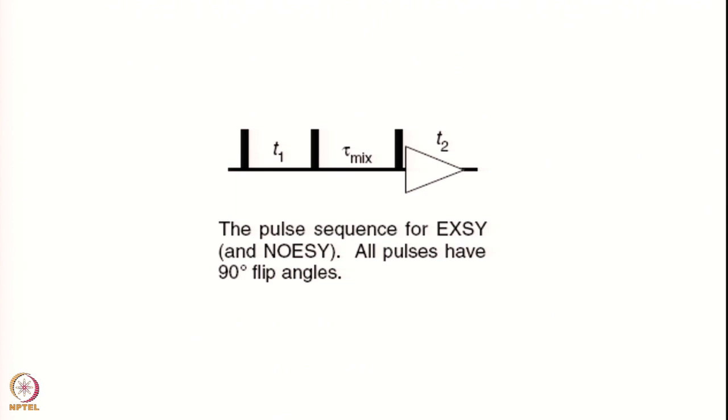Okay. Now, this brings us to another important experiment, and that is called the NOESY. So, we will only make a small introduction to this. We will take this up in greater detail in the next class. This is again an extremely important pulse sequence, and this is extremely useful for determination of the structures of macromolecules, the proteins, the nucleic acids.